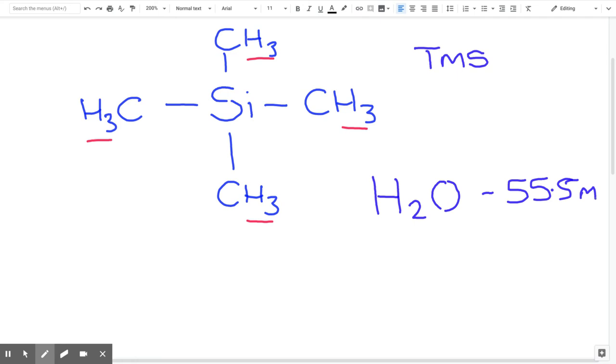So the spectrum will be completely swamped by the presence of the hydrogens within the solvent itself, and the chances of you seeing your actual compound will be pretty minimal. So what we do is, instead of having a solvent with hydrogens in it, we swap that for an isotope of hydrogen, deuterium. So you have D2O, a deuterated solvent, and deuterium is invisible to a proton NMR spectrum.